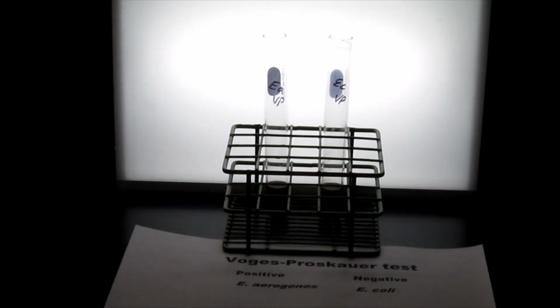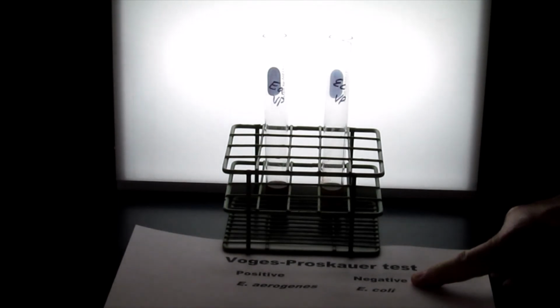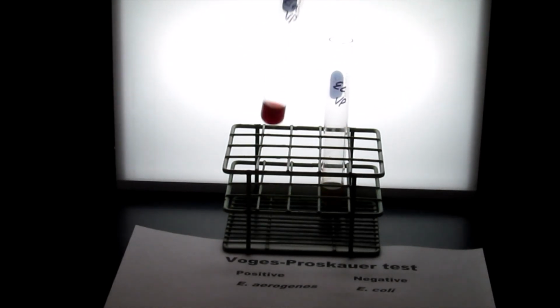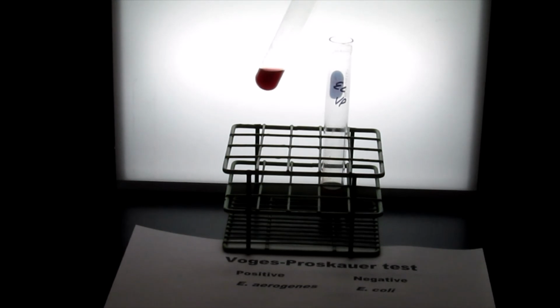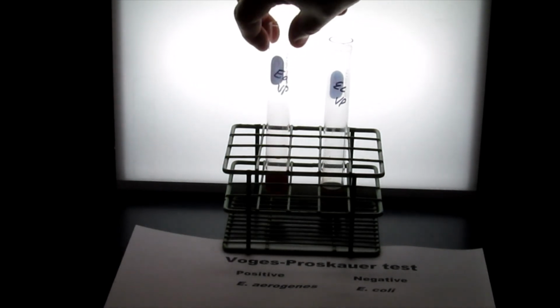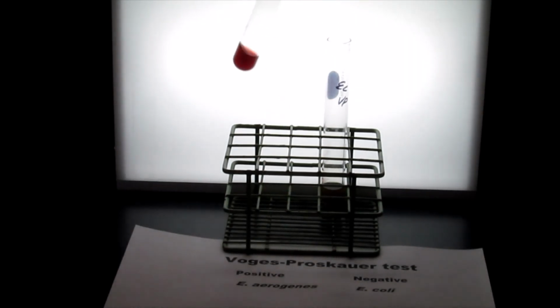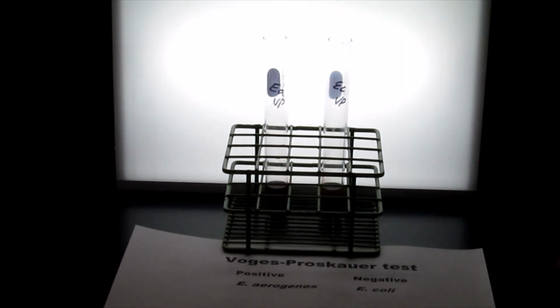Realize that this is contrary to what you saw in the methyl red indicator, where the E. coli was the positive for methyl red, and that makes sense that you produce an acid. You can't also have this neutral acetoin present in the acid conditions, whereas if you were neutral in acid conditions, you could have acetoin present, looking at testing for the presence of acetoin in the VP reagents here. So E. aerogenes would be okay to be present and turning red.